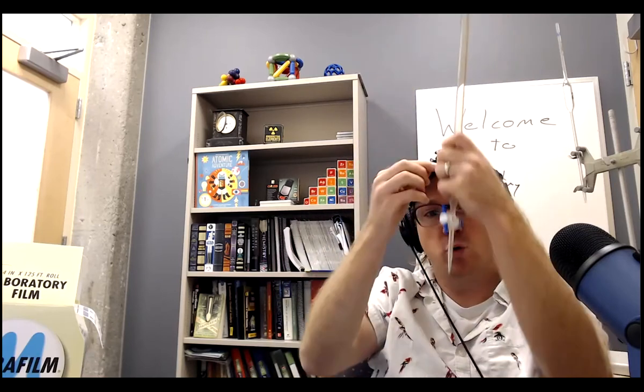Oh, I should talk about the bottom too. This down here at the bottom is called a stopcock. It's a piece of Teflon with a hole through the middle of it. When the handle is up and down like this, vertical and parallel to the burette, the hole is open. So if I started to fill this up, it would go straight through and be pouring all over my lap.